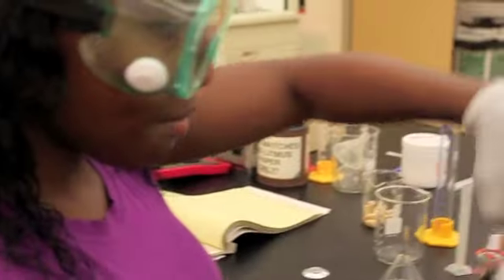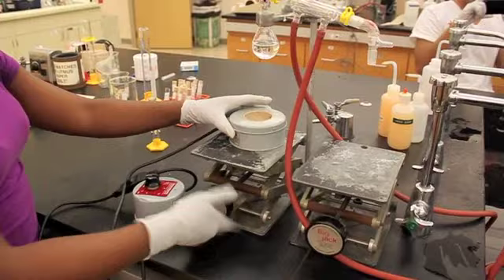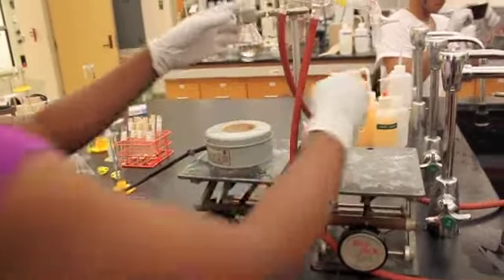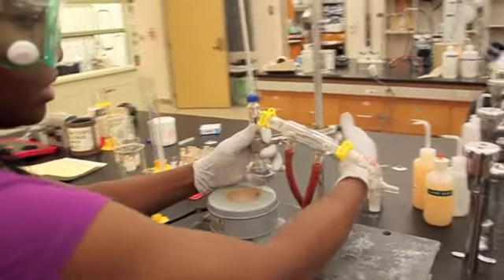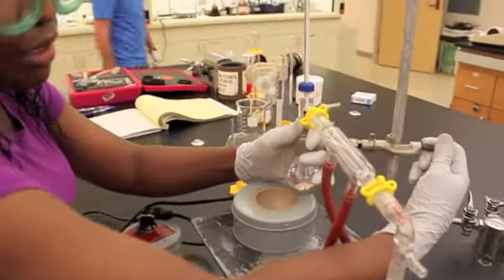You'll place your heating mantle on the jack right below your round bottom flask, and you'll raise the jack. We're gonna connect this tubing. You want to leave enough room to lower and raise the jack. So what I can do here is lower my apparatus to a level that's good enough to be able to move the jack back and forth.